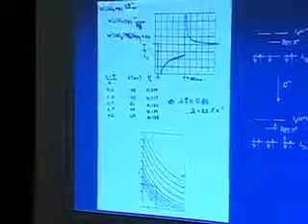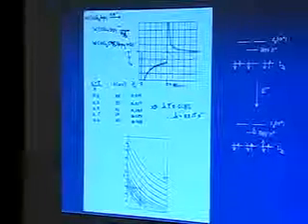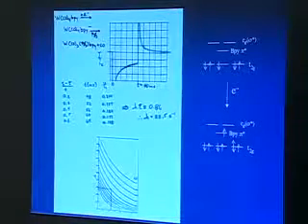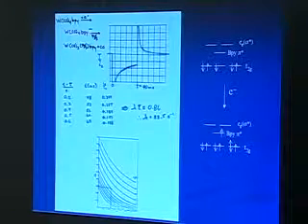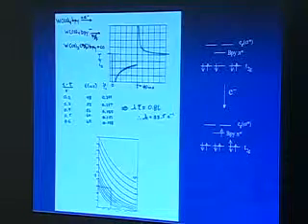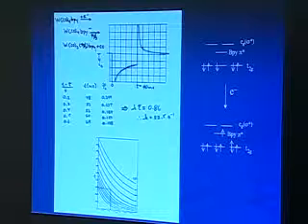Okay, to see how one might use the Nicholson and Shain diagnostics for something a little more complex, let's go back to the example that I gave you the other day of this tungsten tetracarbonyl bipyridine system, where I used it as an example of how one used double-step chronoamperometry to get at a rate constant for, in this case, loss of one of the CO ligands from the system.